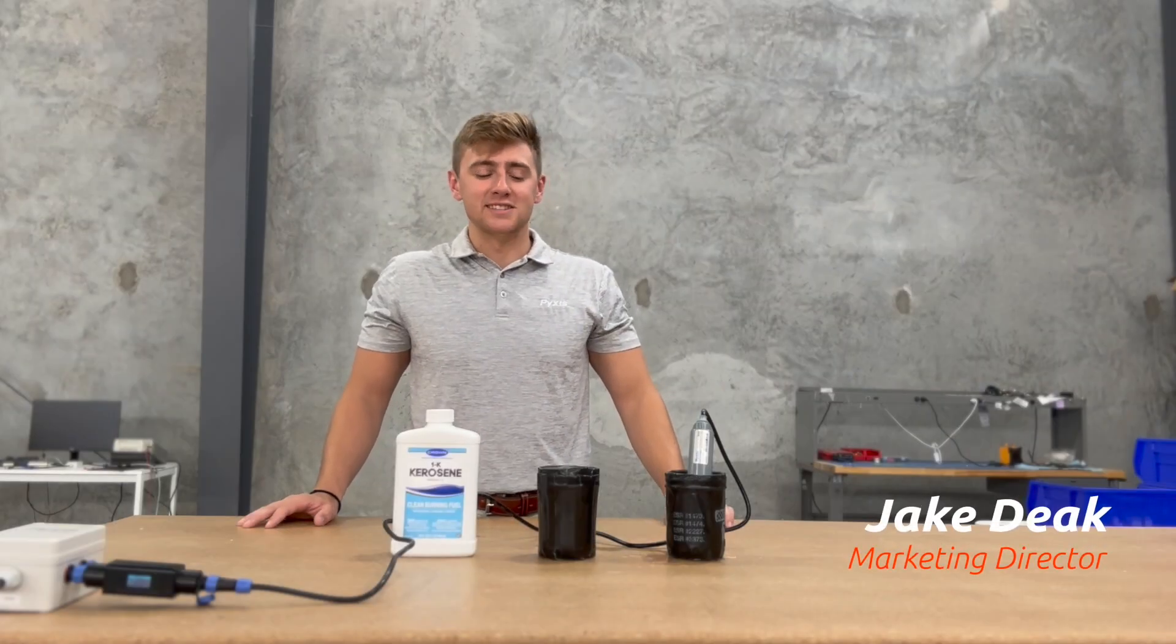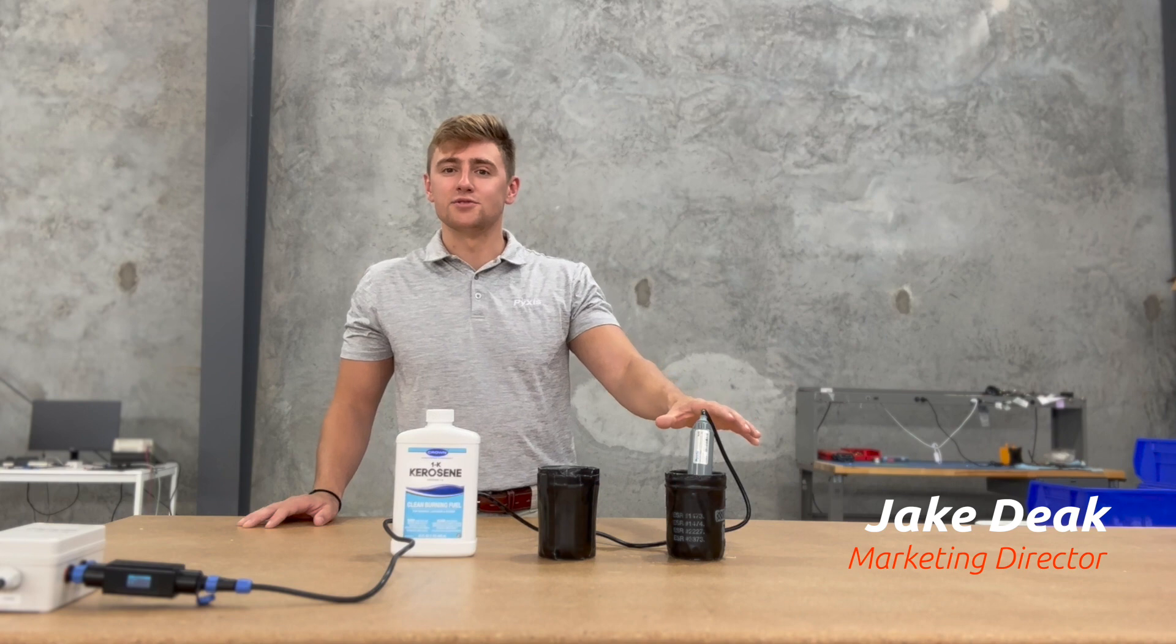Hey everybody, it's Jake Diak with Pixis Lab and today I wanted to break down another series of sensors that we have to offer.